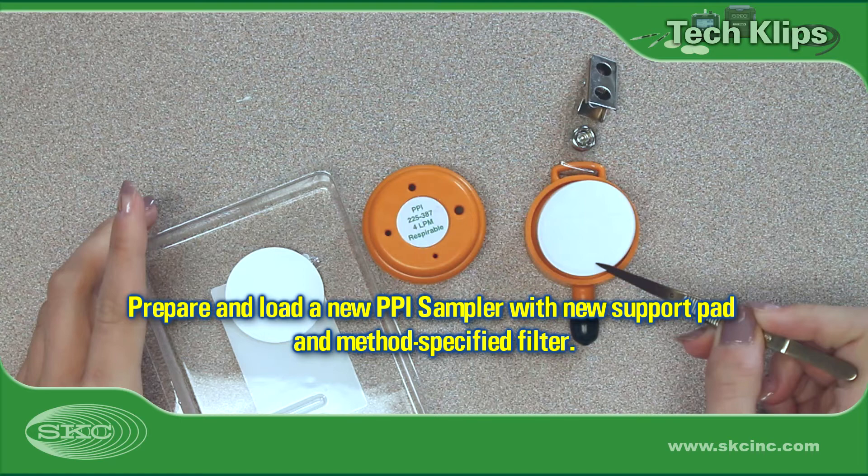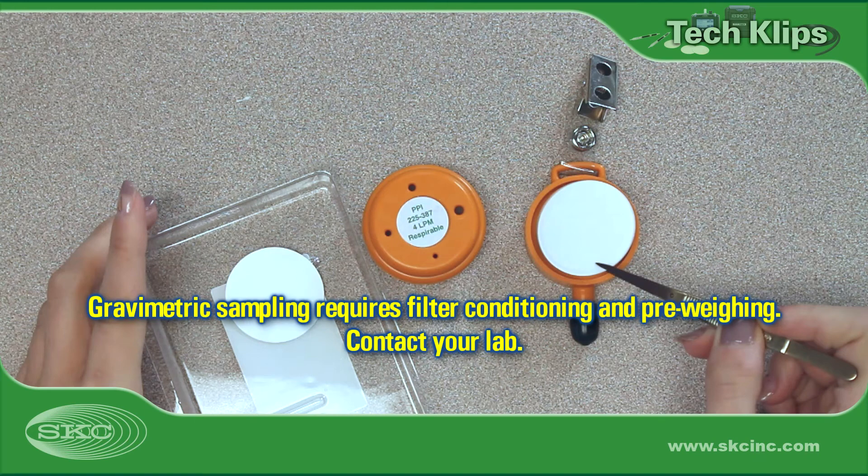Press the inlet plate firmly on the base plate. For gravimetric analysis, consult your laboratory for filter conditioning, pre-weighing, and post-weighing. It is standard protocol to pre- and post-weigh the filter on the same analytical balance.